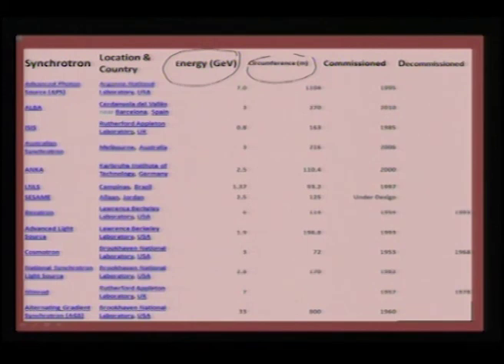Therefore, this is very costly equipment that has to be sustained, and one of the oldest, as you would see here, is from Lawrence Berkeley Laboratory, commissioned and also decommissioned in 1993. Subsequently, a new advanced light source came into the picture, and another one was commissioned when the previous one was decommissioned in 1993.